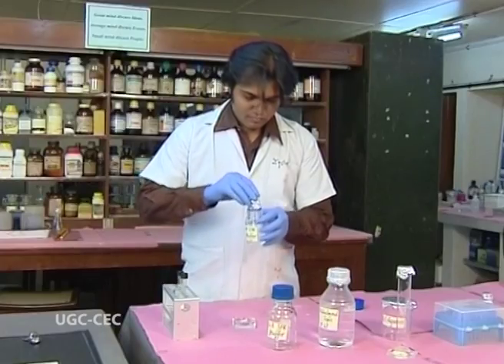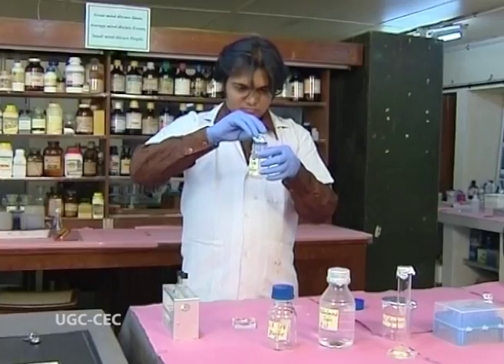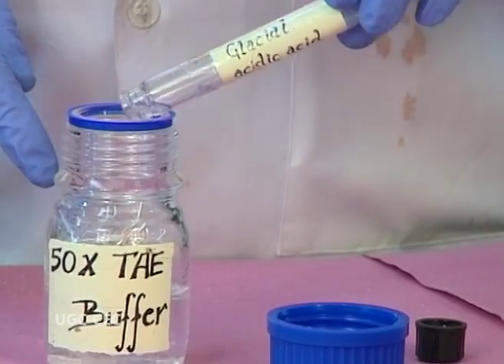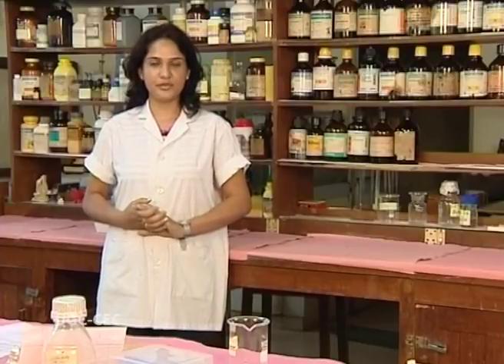Once it becomes transparent and dissolved completely, it is then mixed into the Tris buffer mixture. The first solution is prepared in 40 ml. We add the Tris buffer into the 40 ml solvent so that it gets dissolved. Then the EDTA is added, and after that we add acetic acid, and once the chemicals are mixed, we add the remaining volume and make the volume up to 50 ml. And this 50X solution can be stored for a longer time in the fridge.